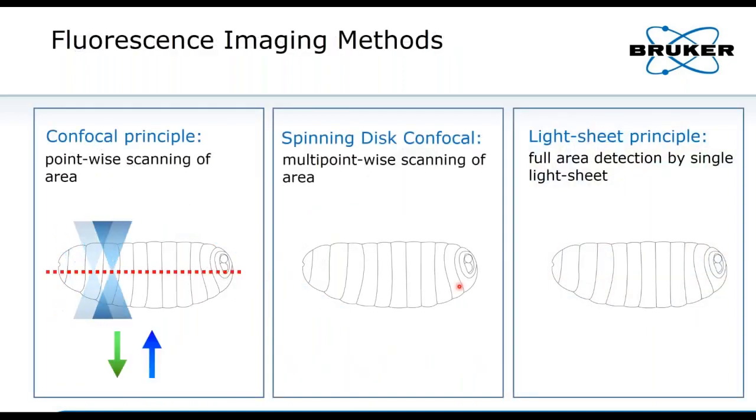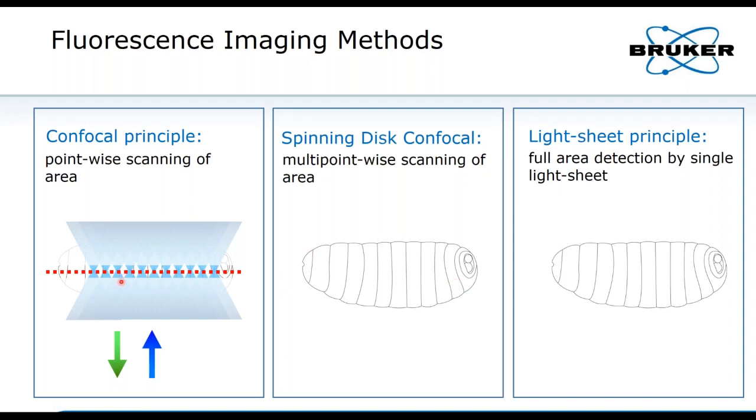What's the advantage compared to confocal imaging or fast spinning disk confocal imaging? What you do in a confocal microscope, you basically scan your object point by point, line by line, frame by frame to acquire the fluorescence distribution in 2D and in 3D. This is a sequential imaging process because you're illuminating just a single spot and you're collecting the light excited in this focal spot, and using a pinhole, you're rejecting a lot of light that might come from out of focus planes. What you do at the same time is you're illuminating your object hundreds and thousands of times also outside the focal plane, so the whole volume basically, without collecting information from that part of the sample, which results in a lot of unwanted fluorescence, unwanted illumination, and thus photobleaching and phototoxicity.